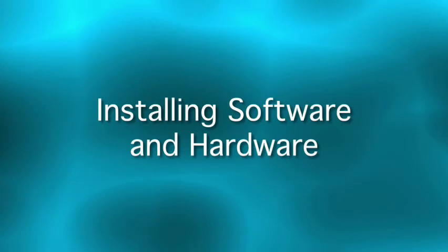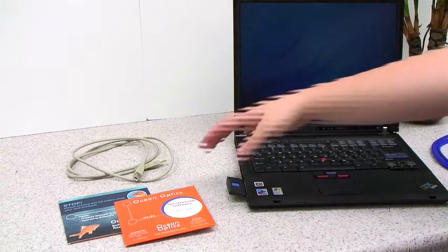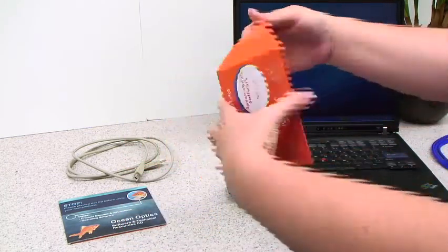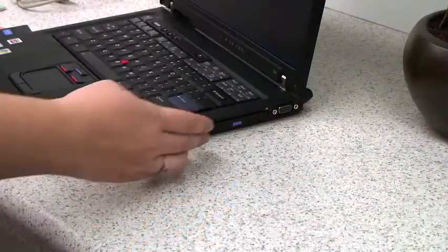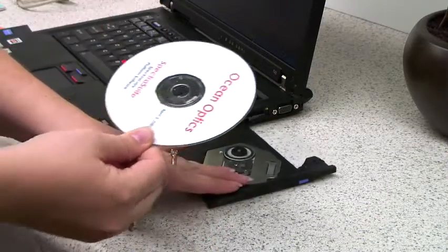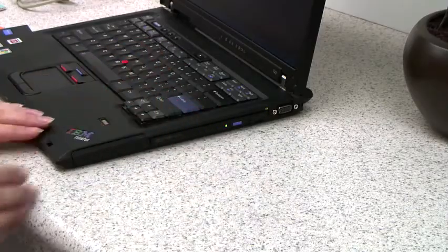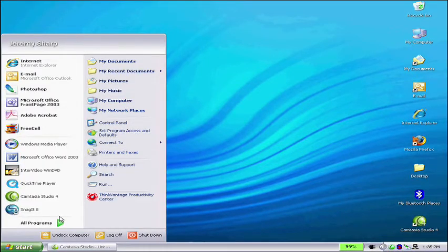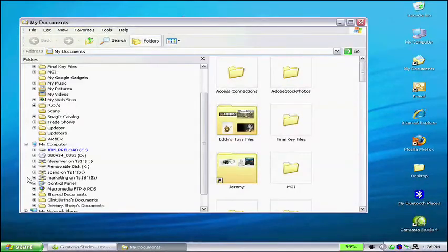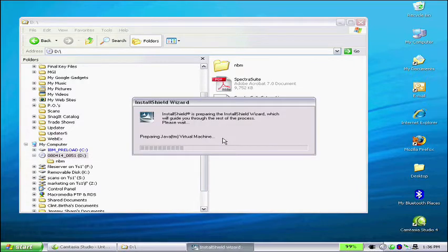Now we're ready to install your SpectraSuite software. For this demonstration, we're running SpectraSuite on a Windows platform, but SpectraSuite is also compatible with Mac OS and Linux. Insert the SpectraSuite CD into your computer. You'll need to install the software before connecting your Ocean Optics Spectrometer. Using Windows Explorer, browse to your CD drive. Double-click on the SpectraSuite setup windows.exe file.